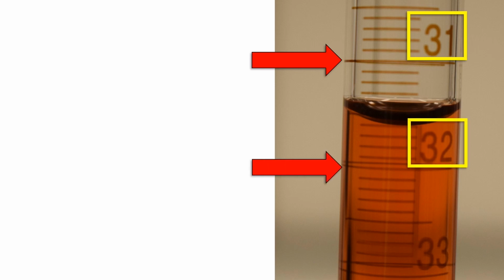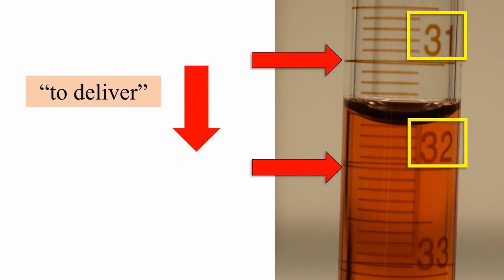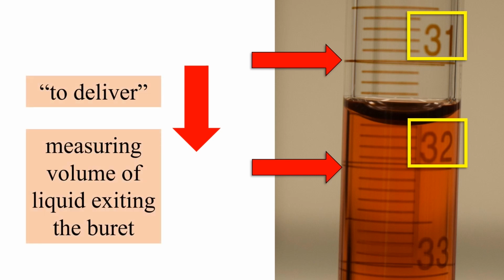Here is an example of the buret. Every major marker on the buret is a milliliter. Here you see 31 milliliters and 32 milliliters. And you see the graduations increasing going downward. This is because burettes are glassware meant to deliver. We are measuring the volume of liquid exiting the buret.